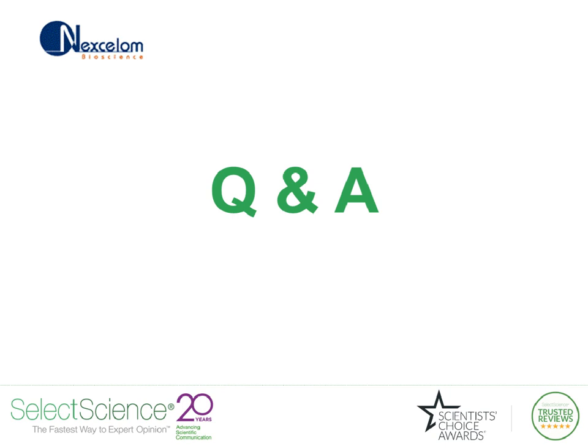Thank you. That's a very good observation. We have seen that in the past. So there's a couple of things that may be happening. One is after a long culture time, sometimes the pH may shift a little bit. That may affect the uptake of the AO. So that's one thing. We are working on another dye similar to AO that will take up much more nicely than AO and stain much more brightly and more localized.